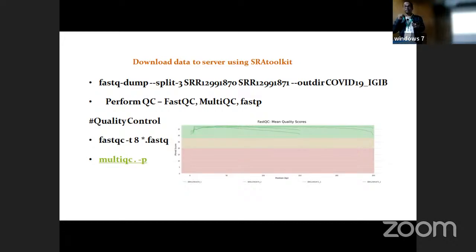Now what is your job? Everything the computer has done. Then what do you do? You have to interpret. Your job is to apply your biology skill in shortlisting, out of 5,000, the top ranked genes or top ranked pathways I have given. You apply your biology skill to tell why this set of genes should be targets and why this set of genes should not be targets. Then again come back to the bioinformatician, who will tell you why you are right or wrong. That's how we can progress to identify potential drug targets.